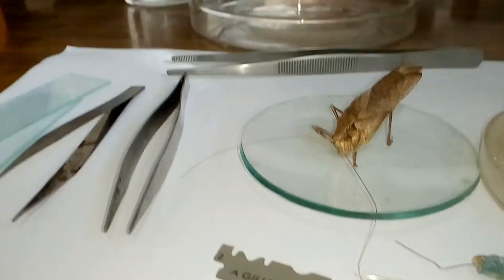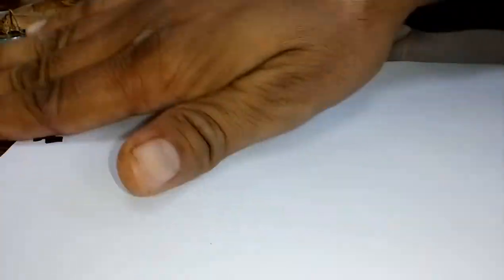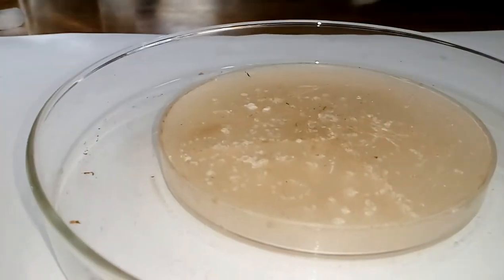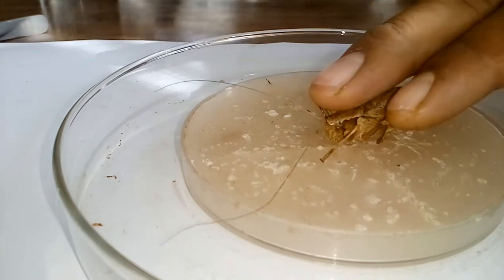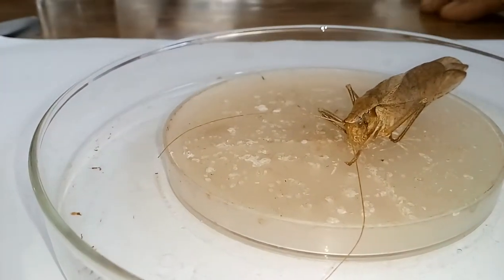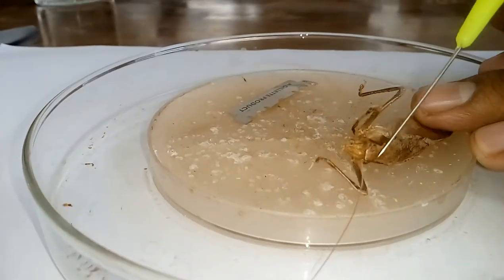First, put the big petri plate in the middle and place your wax plate inside it. Before dissection, you have to check the sample whether it is fresh or not — we require a fresh sample. Now for the dissection, using this blade, look at this area.